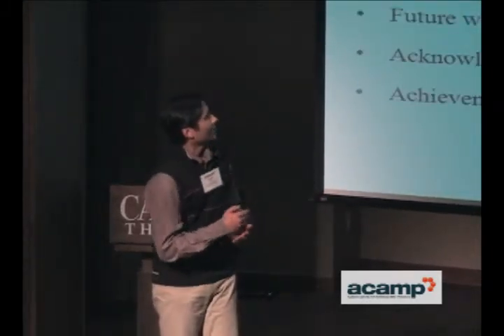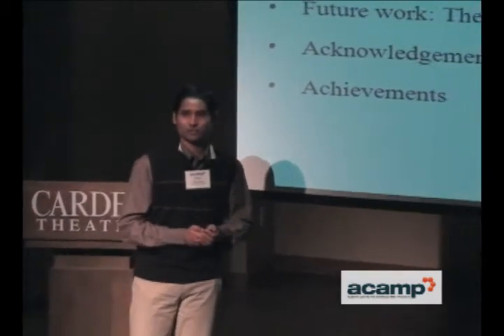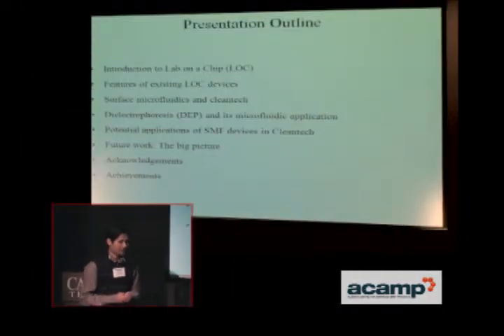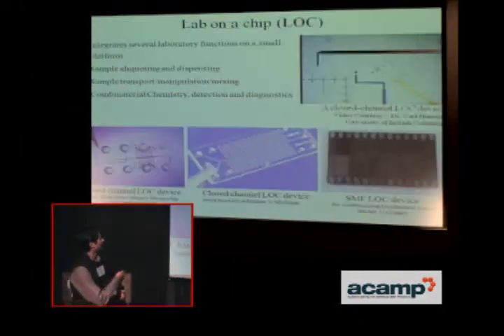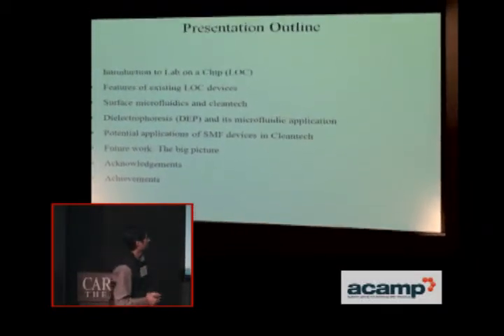I'd like to get started with introducing the term lab on a chip. I know Kevin did a great job introducing microfluidics and lab on a chip, so my work here is relatively simpler. I will move on to talk about the surface microfluidic technology that we offer. The microfluidic devices that we fabricate and produce are based on the concept of dielectrophoresis. So, a little detail about what dielectrophoresis means.